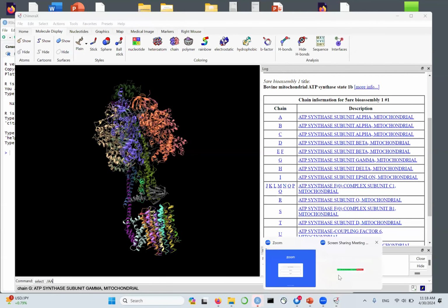And if you look at the residues on the outside, this is the region corresponding to what you see in the yellow here. On the outside, you see all the residues that are hydrophobic. You have valine here, another valine, you have phenylalanine here, tryptophan, and so forth. So this side that's in contact with the lipid is hydrophobic. Whatever is inside lining the channel is going to be more polar. So here you're going to have a pattern of residues that are hydrophobic, hydrophilic, hydrophobic, hydrophilic, hydrophobic, hydrophilic. Its periodicity is going to be just one hydrophobic, one hydrophilic.